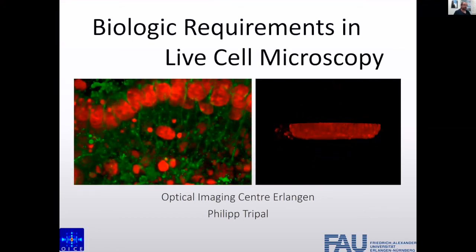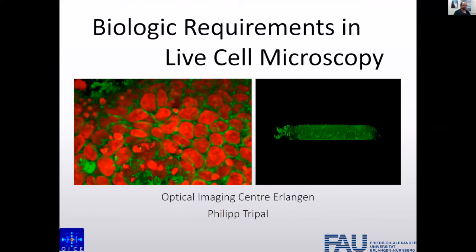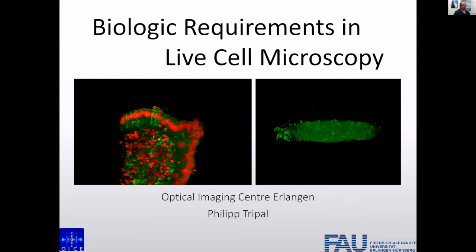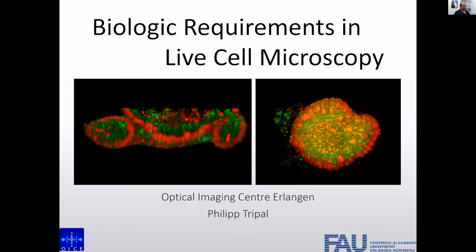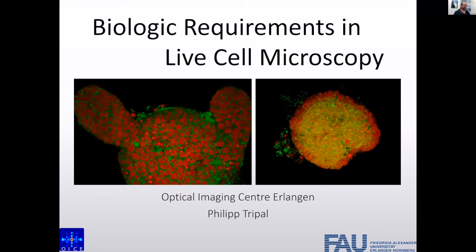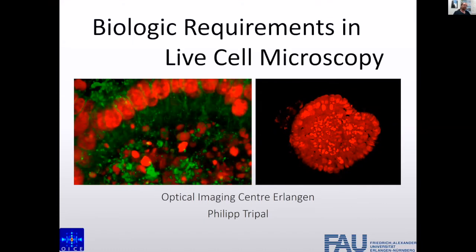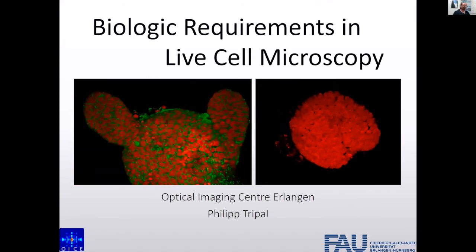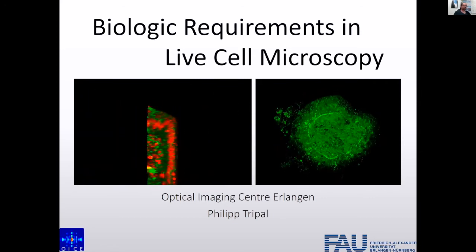As Daniel already mentioned, I'm a cell biologist in the core unit for optical imaging. So every day I'm confronted with different imaging tasks, and most of them are live cell and go deep and high resolution. And with my presentation today, Biologic Requirements in Live Cell Microscopy, I want to point out important physical factors which have to be controlled or at least monitored when it comes to live cell microscopy.